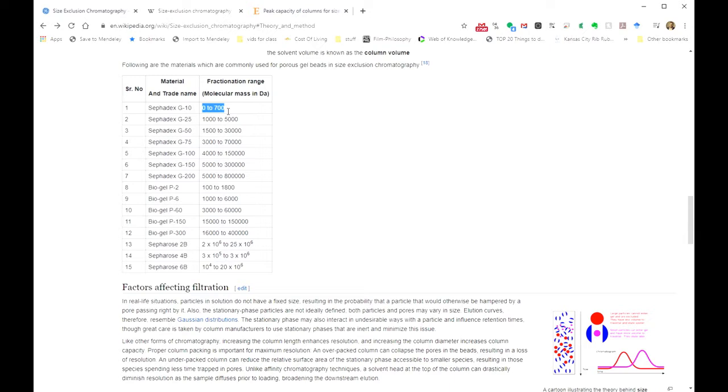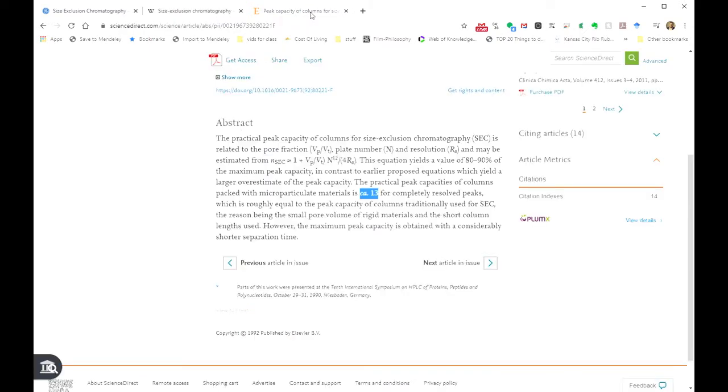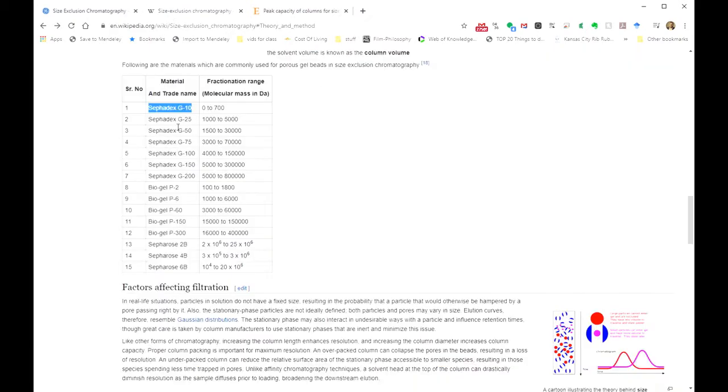will your two analytes that you're interested in land in two different regions of those parts? And if they do, you can have some confidence that your species are going to resolve by size exclusion if you're using this material and you're following best practices of the methods designed for this material. So take-home message, we're not talking about super high resolution here. We're talking about pretty poor peak capacities divided across what can be some really, really broad molecular weight ranges.